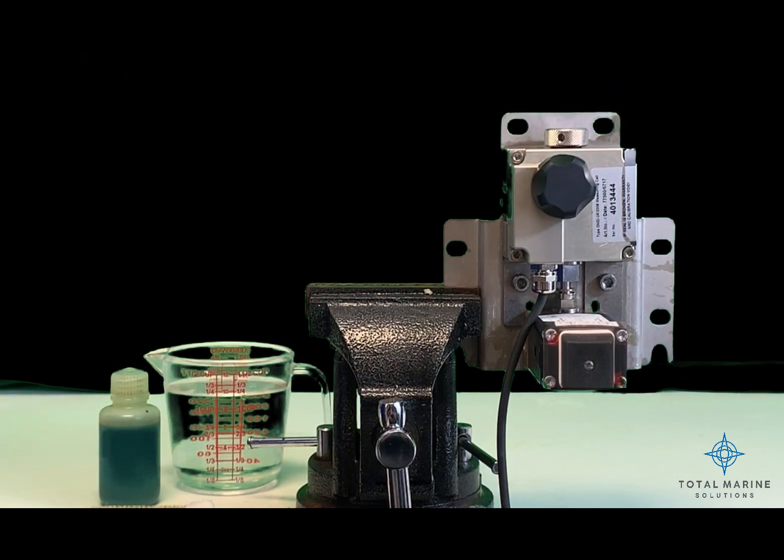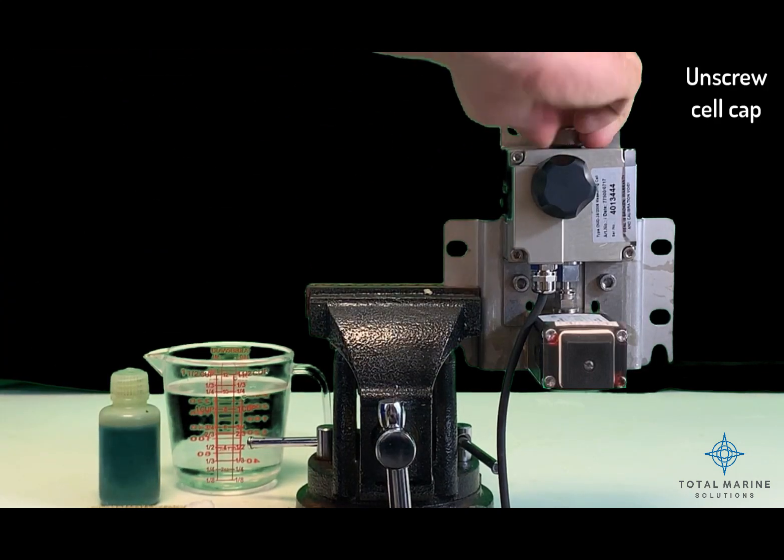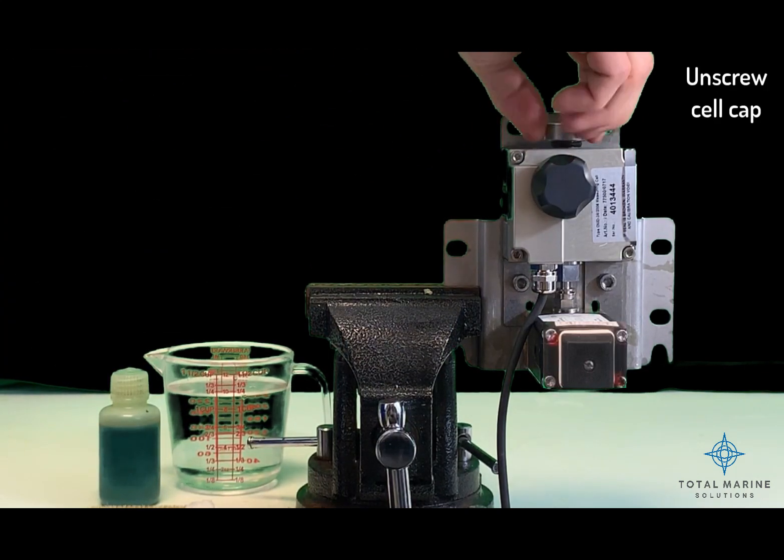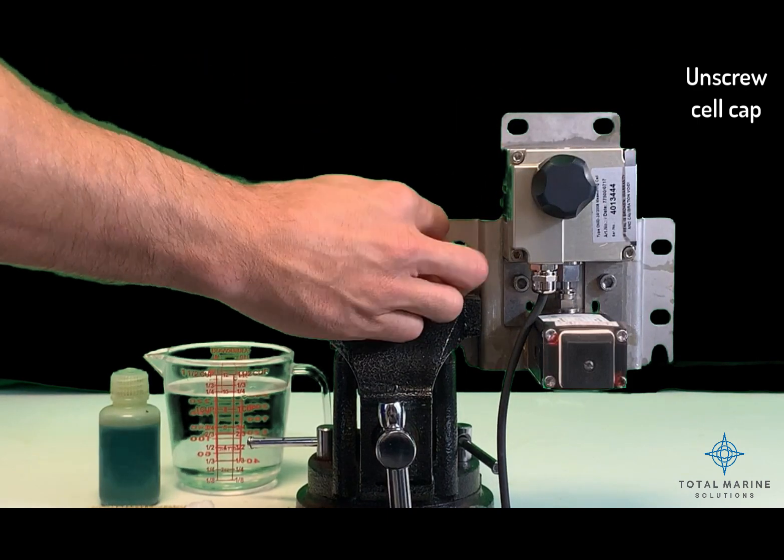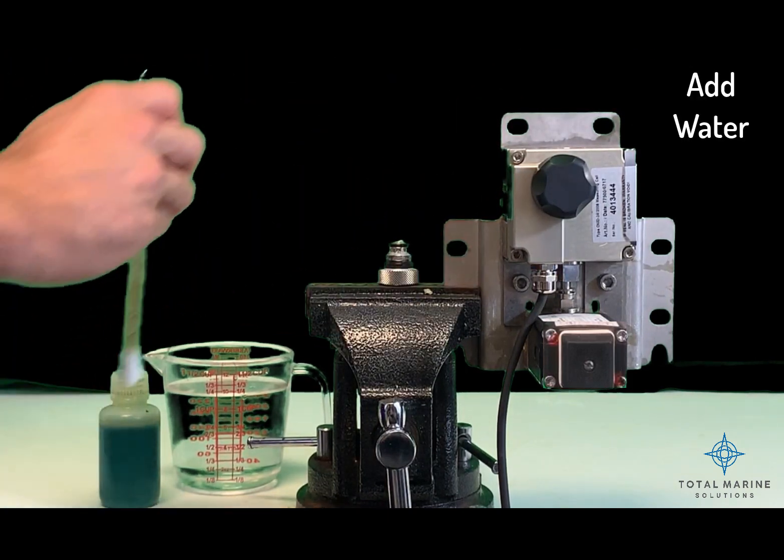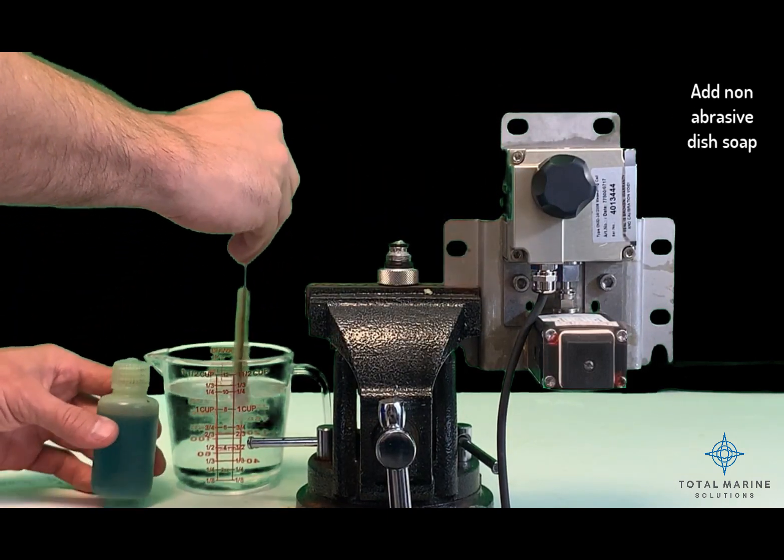If a more intense cleaning is needed, remove the cell cap. Use some water to wet the cell cleaning brush and add a drop of non-abrasive soap.